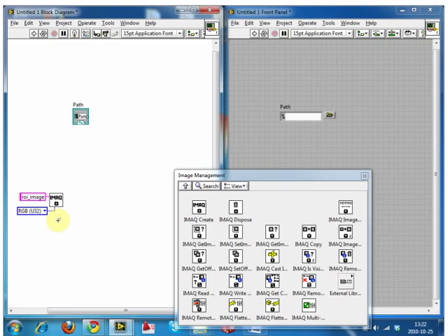A correctly made image should never have the maximum value, because it means you're losing information. You don't know if that should be 255 or 256. But if it only went to, let's say, 252, you didn't reach the maximum sensitivity of the camera, so that is a correct image. If you go to 255, you don't know if that's 255 or 10,000, because you don't have any quantification. Anyway, so we made an image.